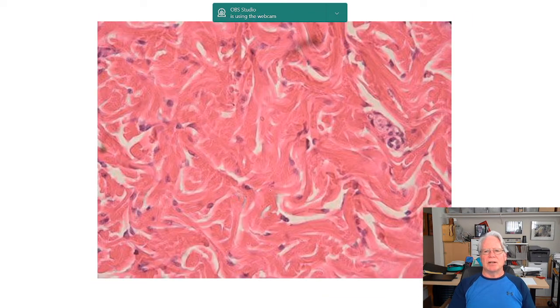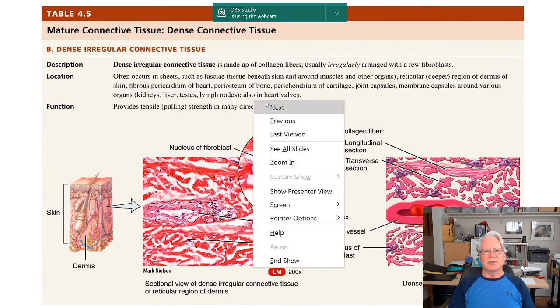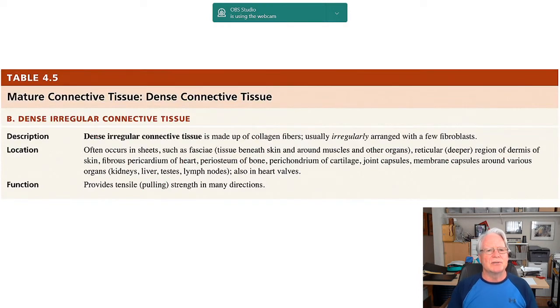Same thing, a little bit less clear, but you can see that the pattern is very irregular, and we don't get that nice flowy kind of river of worms that you saw with the other one. So let's move on.